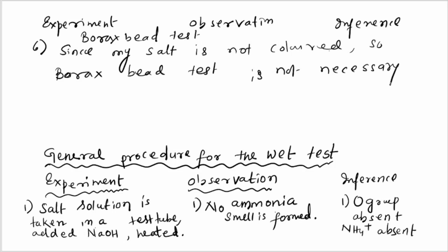That means the borax bead test is not required, because the given salt is not colored.